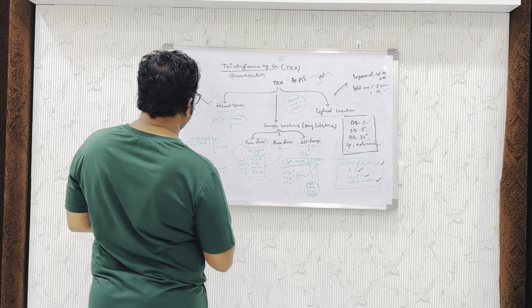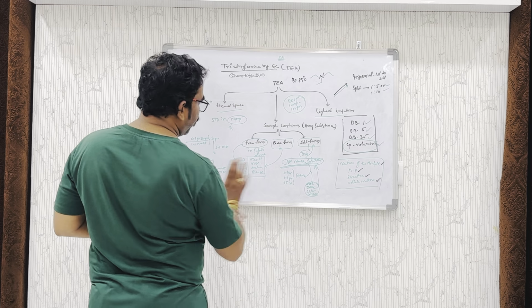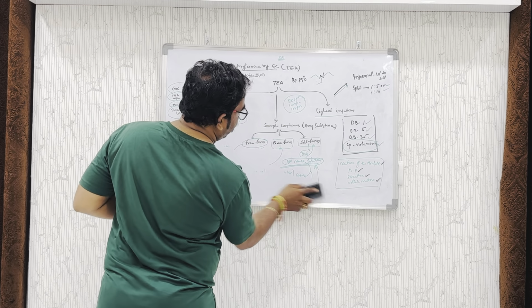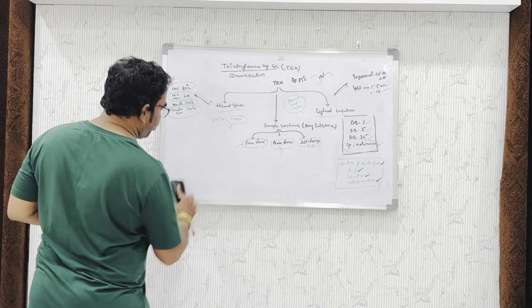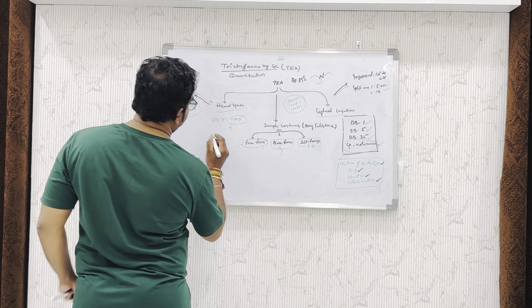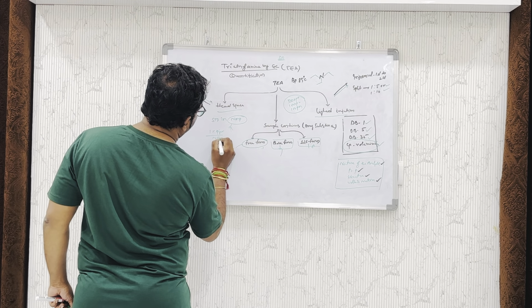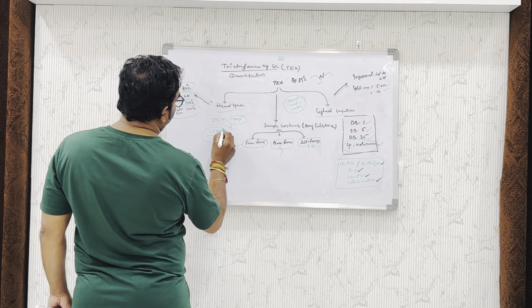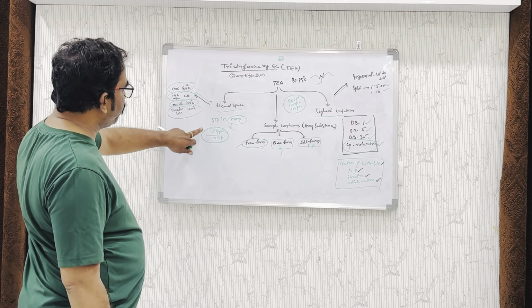Here especially this is important to analyze. By liquid injection there is no issue. Carryover will also not come. You can inject a blank in between, and it will not come. But when we are analyzing by headspace, this is important. When we are adding piperazine by headspace, because we are preparing 1% piperazine in NMP, this piperazine will work. It will reduce the carryover from injection to injection. How does it reduce the carryover from injection to injection?